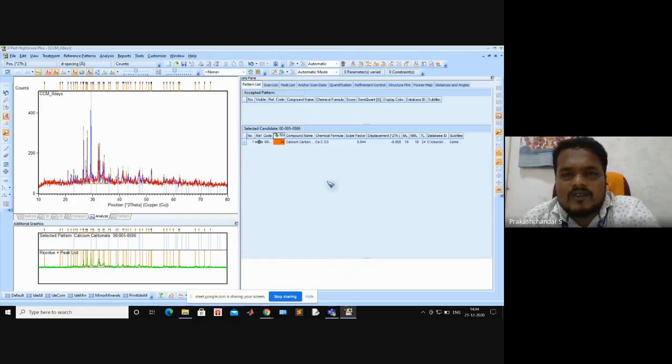Okay, now we need anchor data to draw the graph. We can note down that this peak value is CaCO3. Which one? 29.54. Here in position 2 theta, you can check it. If I touch the peak value, you can find the reading values. See here, 29.42. So that is the 2 theta position for CaCO3, calcium carbonate. So you can write it here: this peak value is CaCO3. I will explain how to write it.